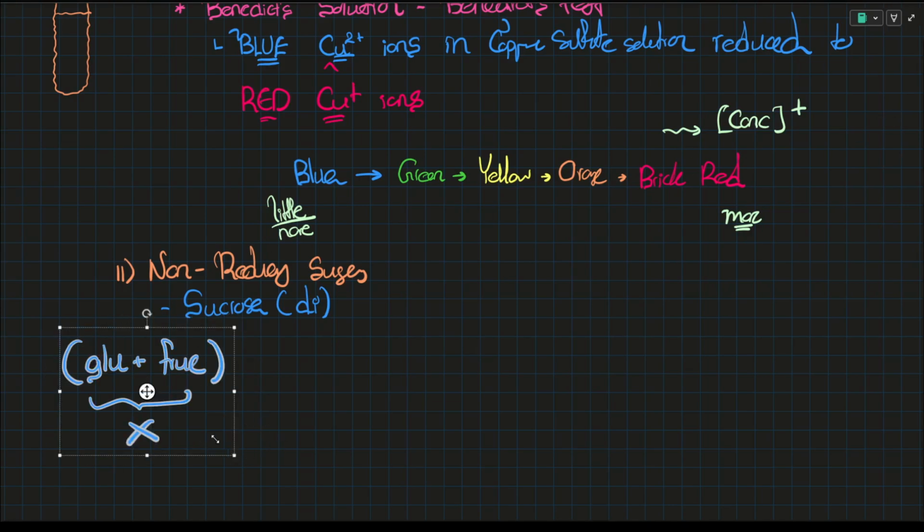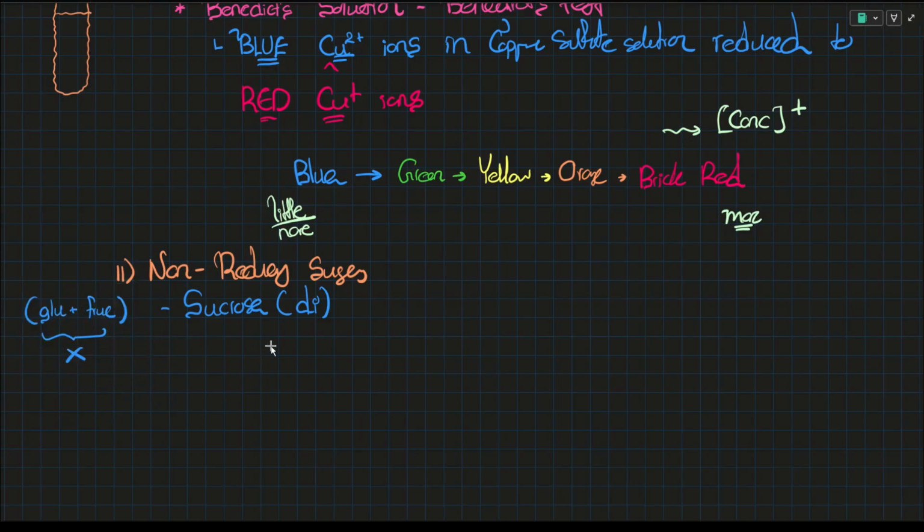Now here we have to do something else to identify sucrose. You have to undergo a special procedure known as acid hydrolysis. What exactly is acid hydrolysis?